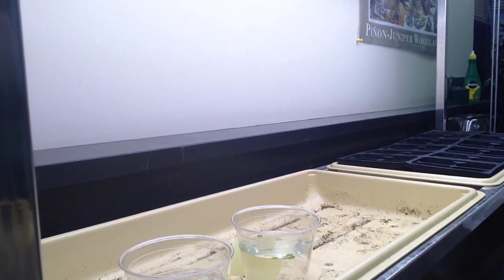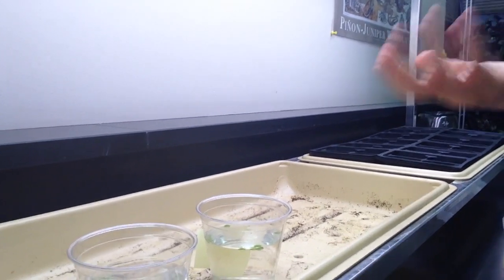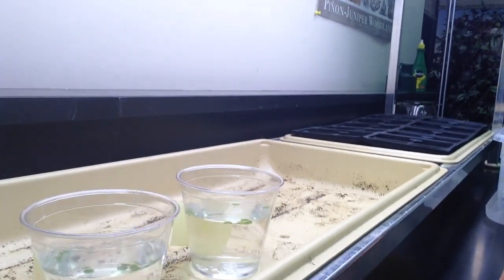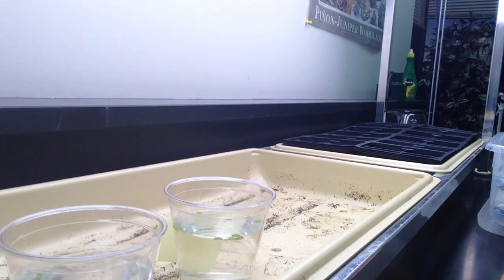If it's nice outside and you want to compare one of our inside lamps to the outside sun, you're welcome to do that. Same procedure exactly — go outside, put it on the concrete, and see what you get.